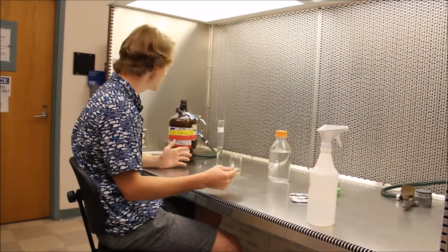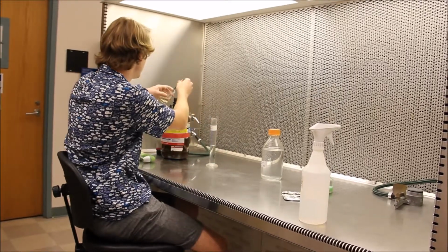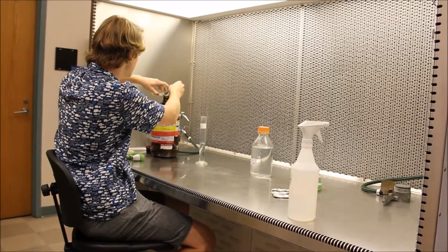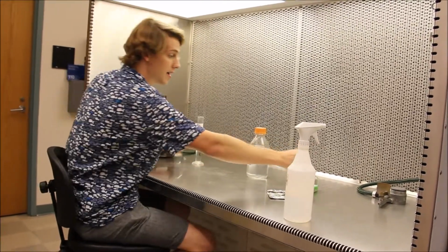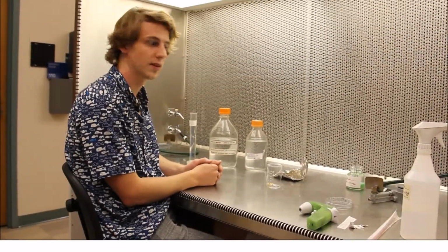Alright, so after 30 seconds in the 70% isopropanol wash, we pour off the liquid. And then we add 20% bleach for 5 minutes.